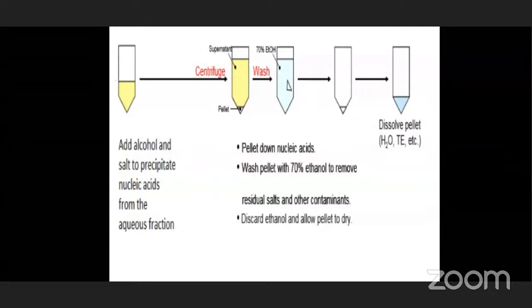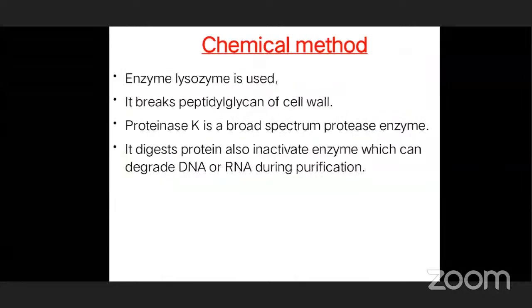TE means a buffer of Tris and EDTA, and that solution contains the pure form of the DNA. This DNA will be dissolved in water or Tris EDTA. That DNA sample is used for PCR, DNA sequencing, restriction, fingerprinting, etc. Okay, here this organic method is completed.